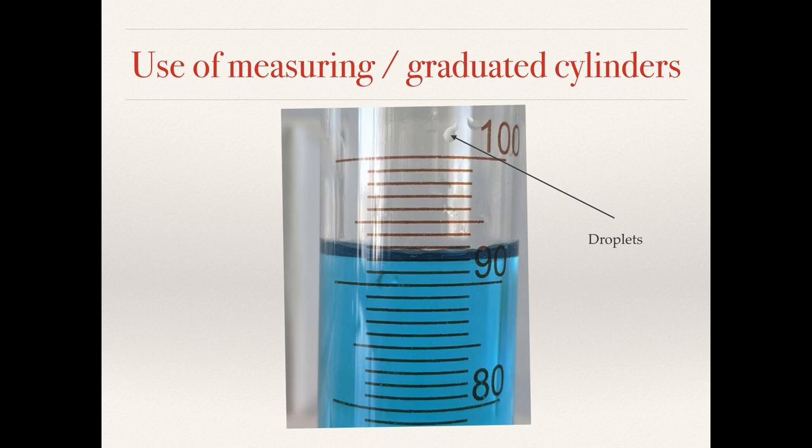If you're trying to be very accurate you have to be careful with any droplets stuck to the glass that are not part of the main liquid in the container. If you pour out the liquid these droplets will be included in the total that you pour out but they haven't been included in the volume that you've measured. It's less of a problem when you've got 92 millilitres and very small droplets, but if you're measuring out one or two millilitres and you have droplets at the top that could actually represent quite a large percentage error.